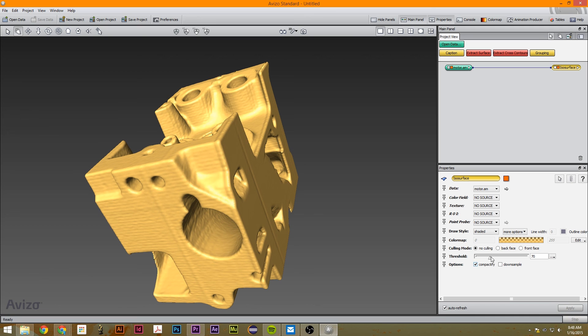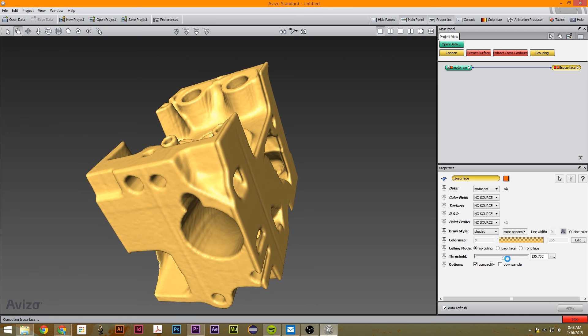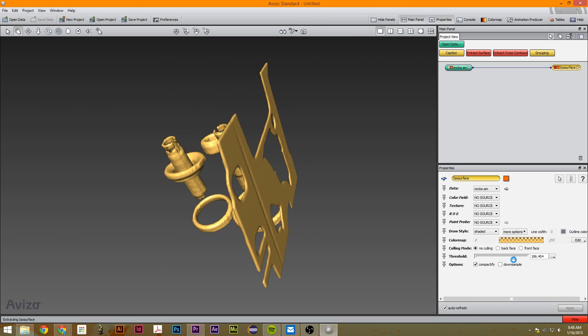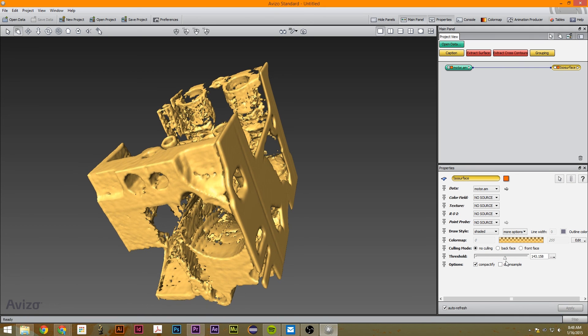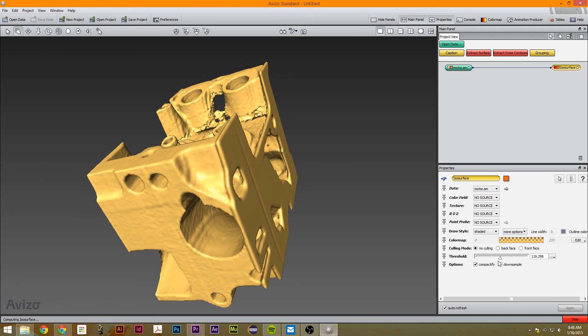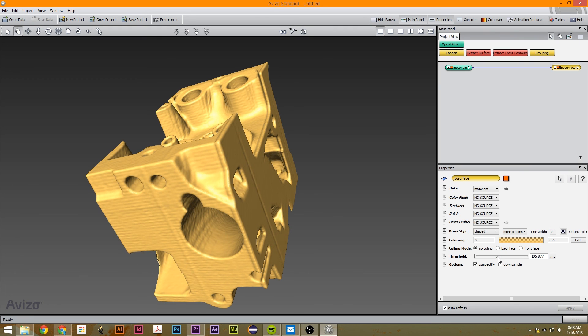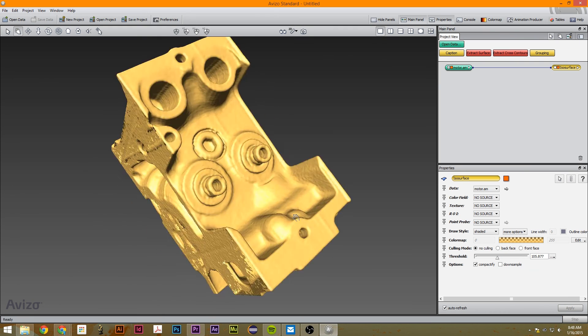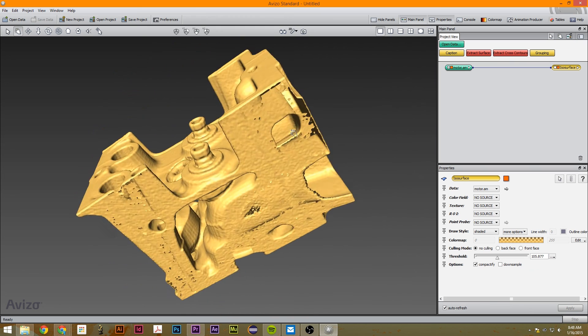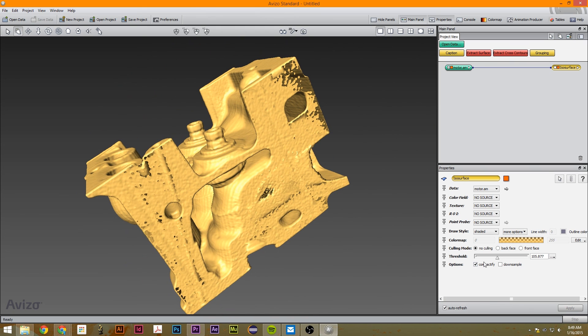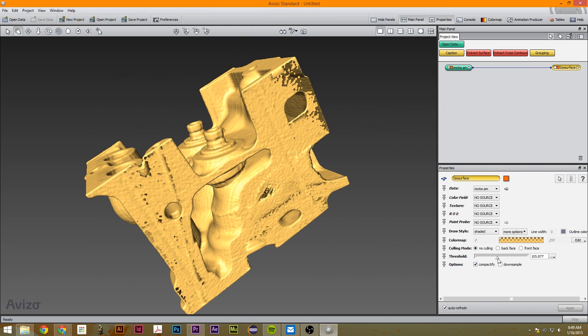So as you see, when I change this, it's like the threshold. It's like the color map in volume rendering or ortho slices. It's practically the same thing.